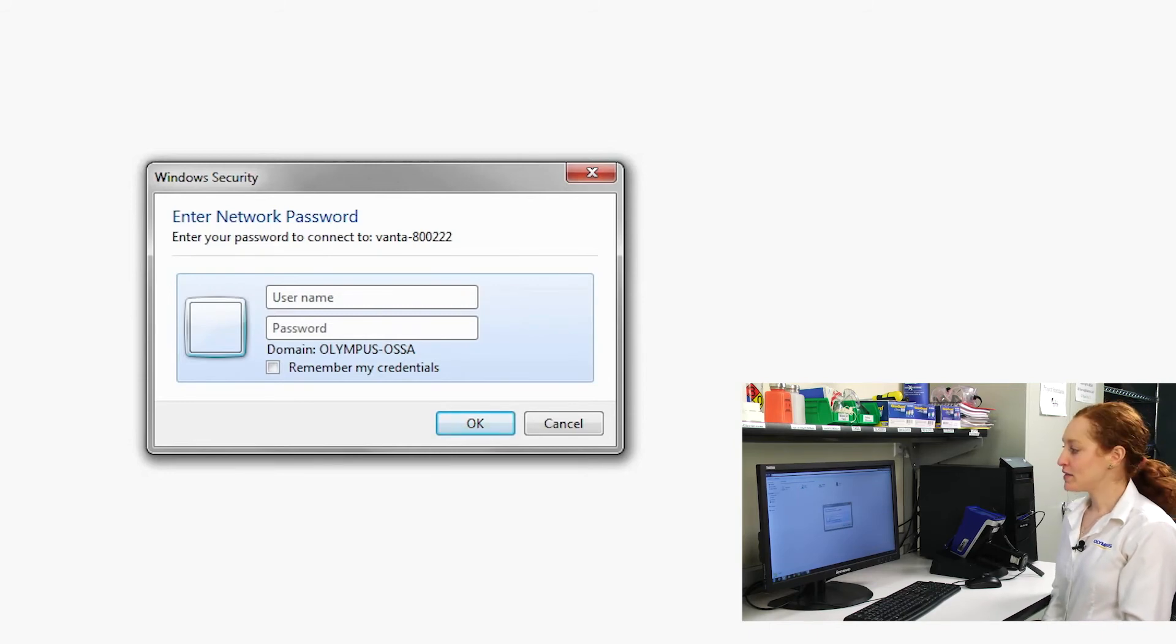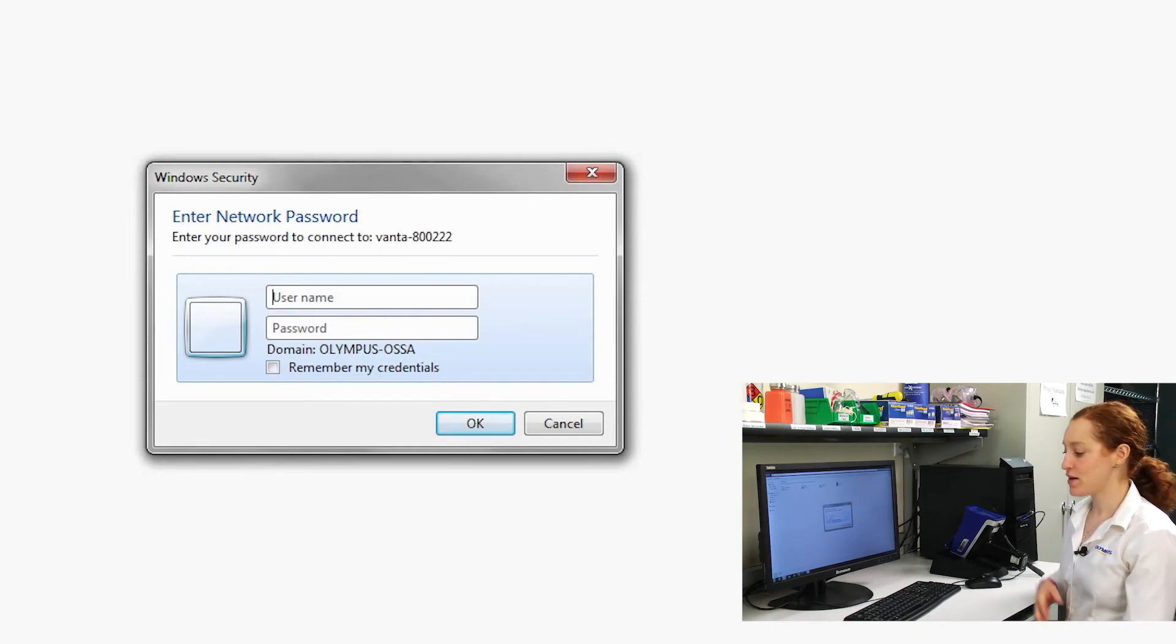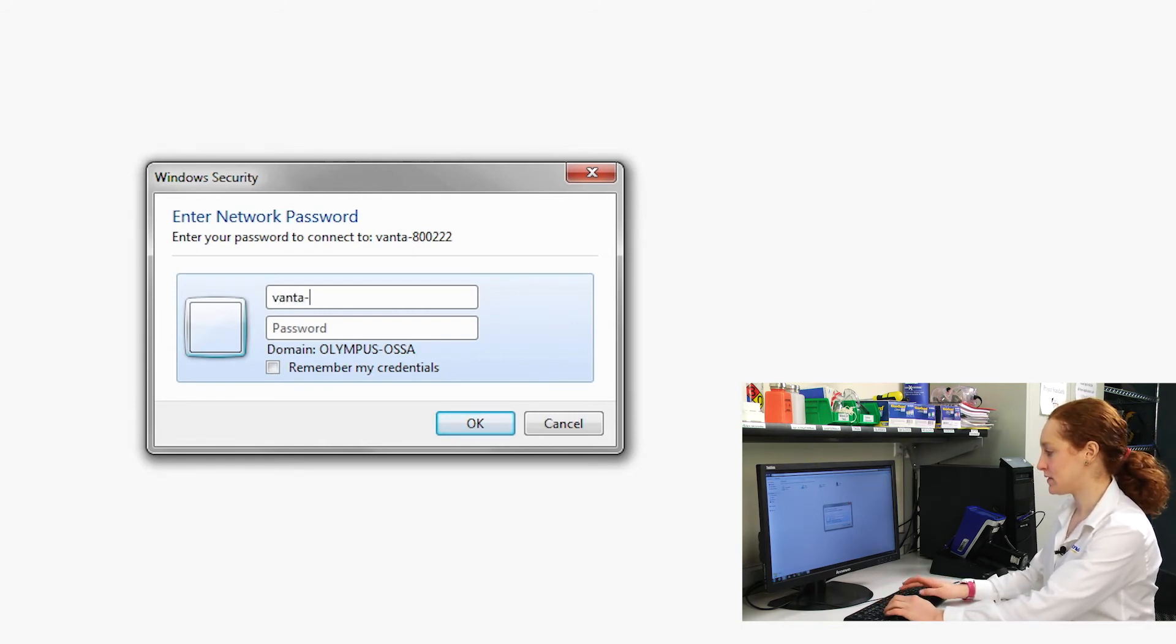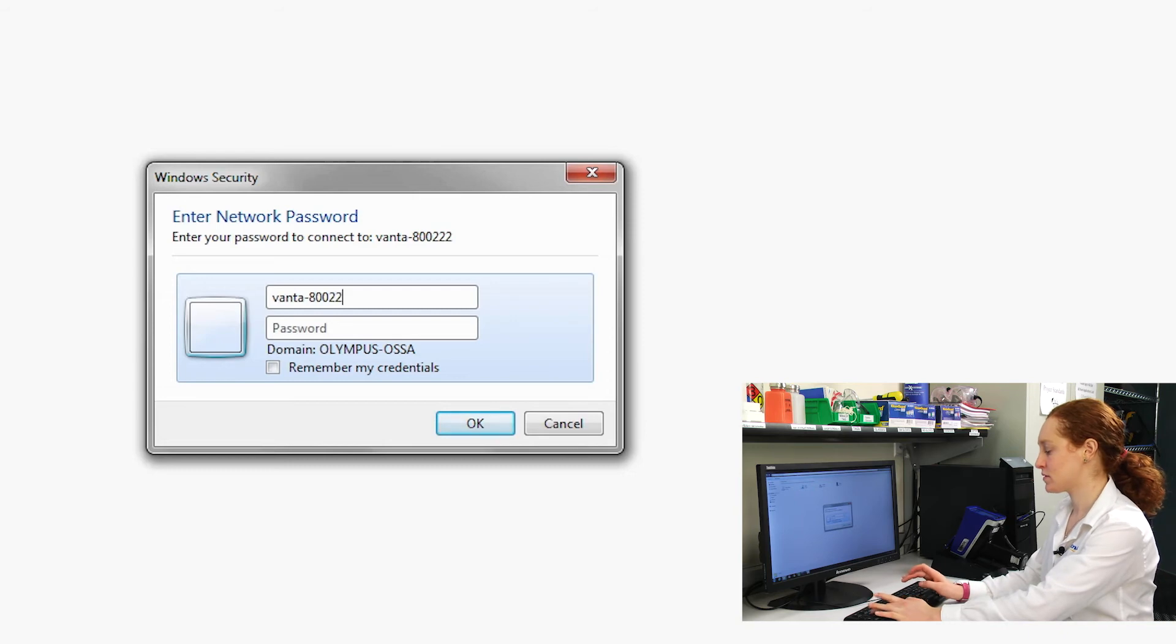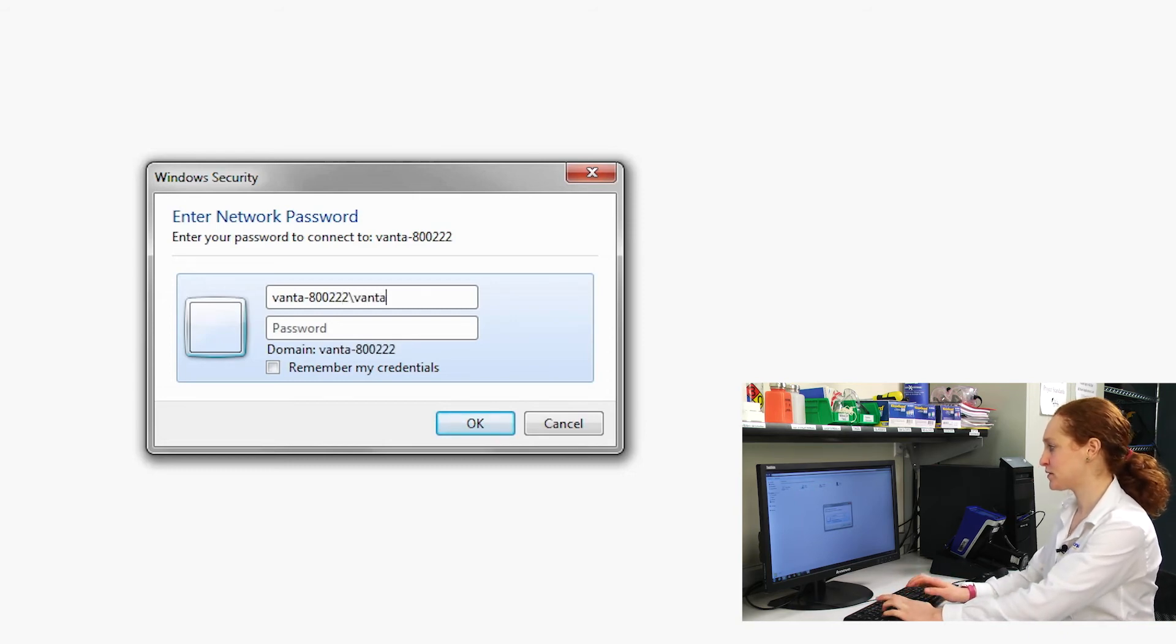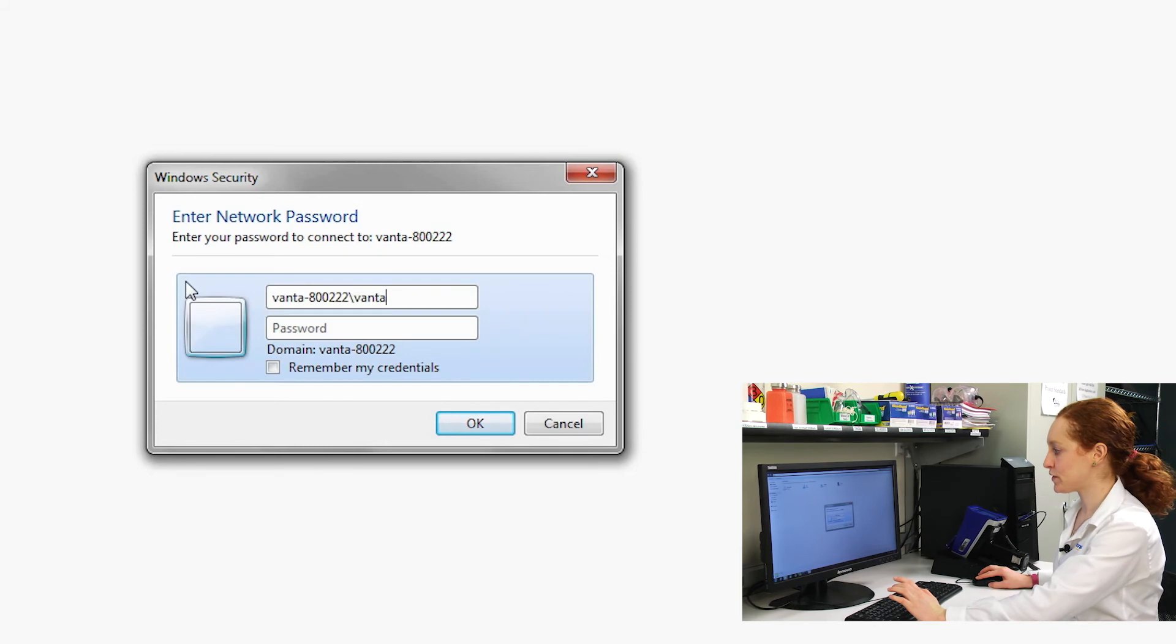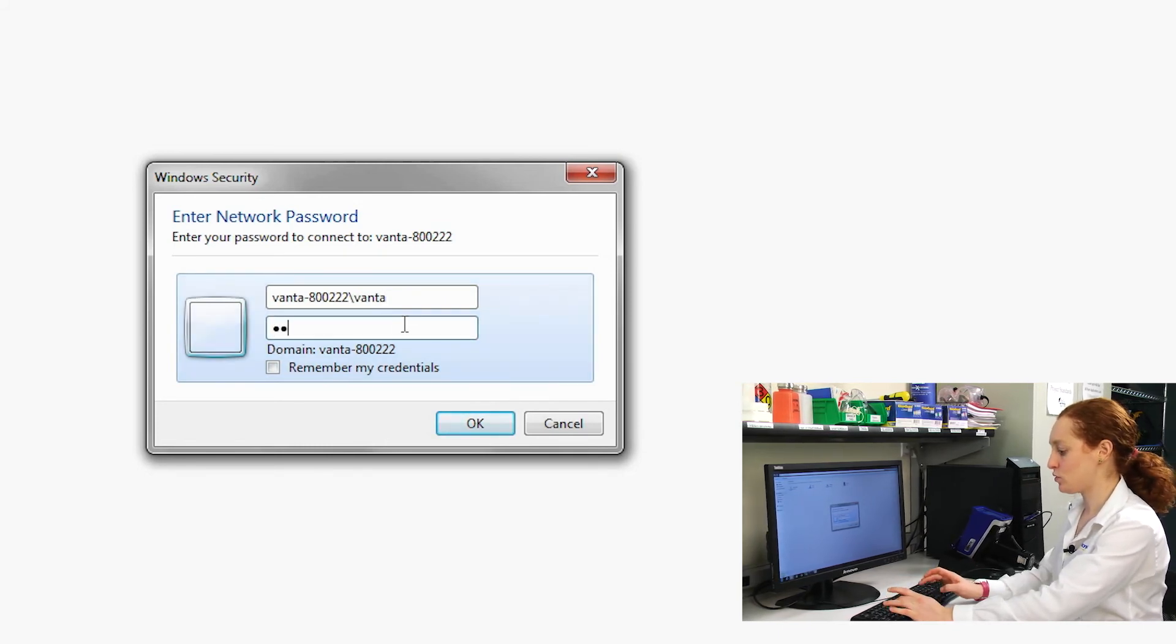Now a dialog box appears asking for username and password. The username is Vanta dash serial number backslash Vanta and the password is Vanta, all lowercase.